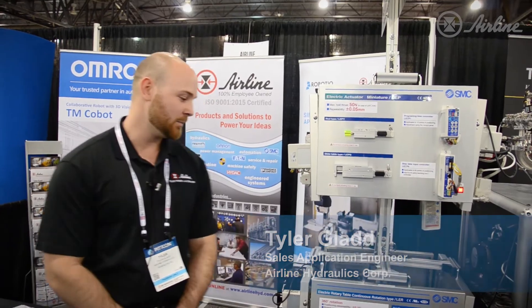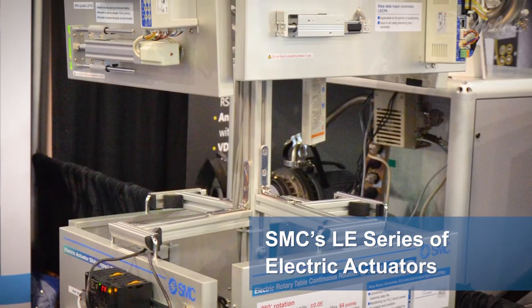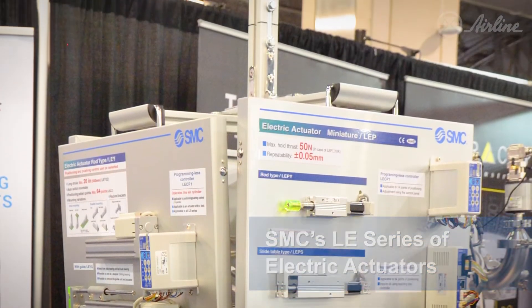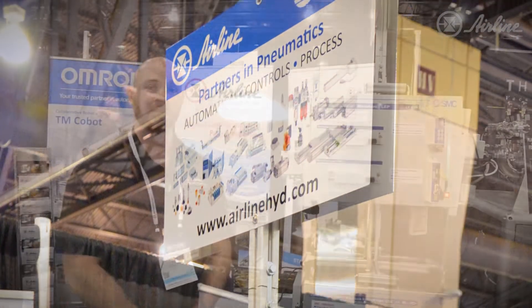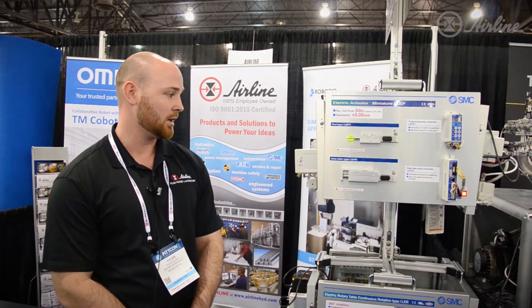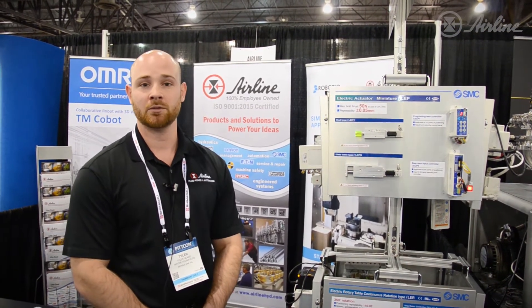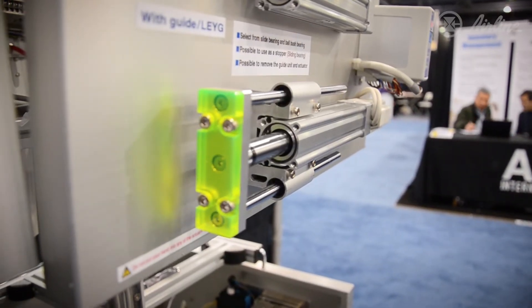Hi, I'm Tyler Glad with Airline Hydraulics. I'm one of the local salesmen out of New Jersey. Here at the PitCon show we have our SMC tree with our LE series from SMC on electric actuators. One of the main advantages with the electric actuators over their pneumatic counterparts is the fact that you can program in speed, acceleration, pushing force, and multiple different positions — compared to pneumatic actuators where you don't have any of those options.